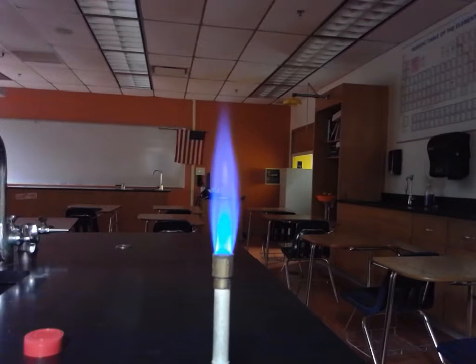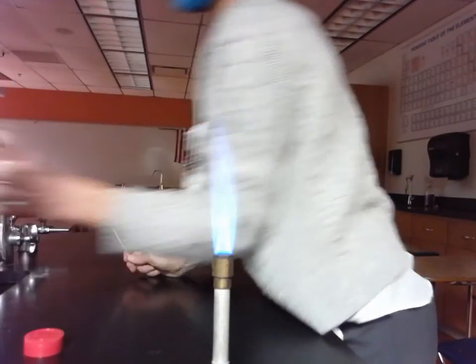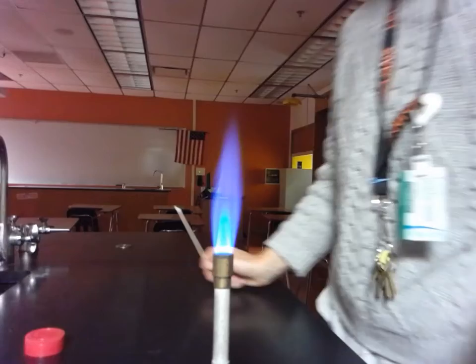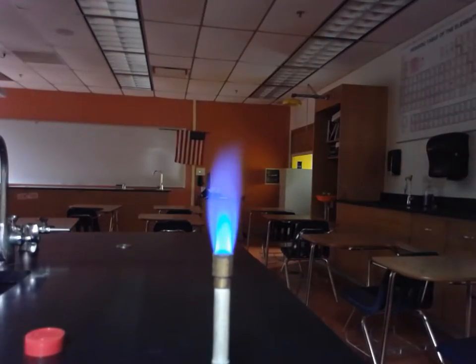Alright, this is the flame test lab, and we're going to take Q-tips. I'm going to dip them into good old-fashioned water. You're going to collect your knowns and then try to identify your unknown.